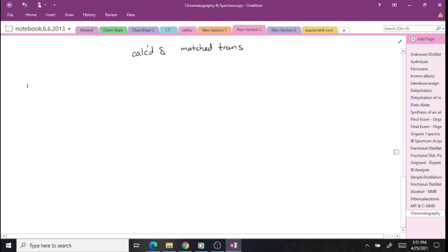So from here we will move on to carbon-13 NMR. Again, you should know the general areas that peaks absorb in. The compounds you'll be looking at will be similar to the ones that you analyzed in lab, so you won't be seeing something totally unique. So basically, carbonyl and aromatic regions, and the alkene region, which overlaps aromatic, but you should know those regions.